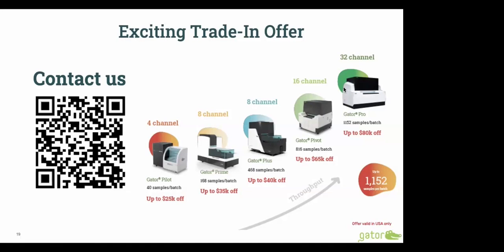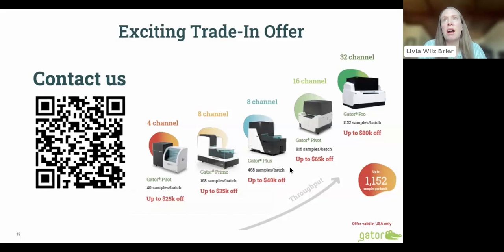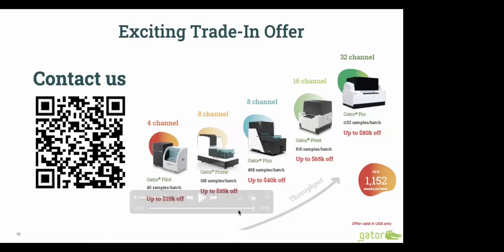The next question: the slide showing the curves with buffer optimization to lower the non-specific binding showed the highest increase. So I believe this is a question for your team, Valitor. Yes, those are some of the standard ways that we had thought of, in communication with Gator, when we were having this non-specific binding problem. But with a lot of this type of method development, because we didn't necessarily know what was causing the non-specific binding, some of those didn't work. As was clear in the method there, that's why you have to just trial and error things. We were a little disappointed that none of our ideas improved things as we had expected. But yes, that's an astute observation.